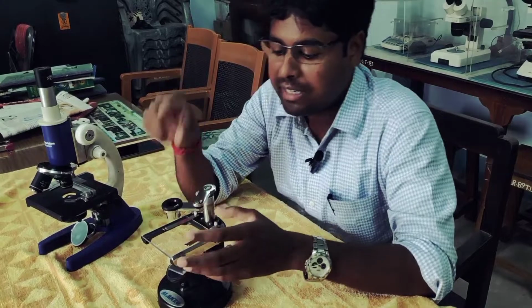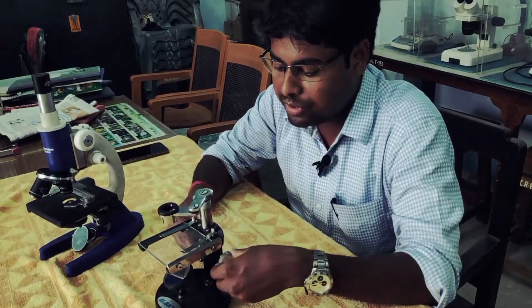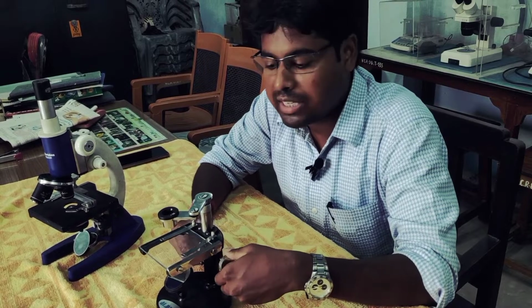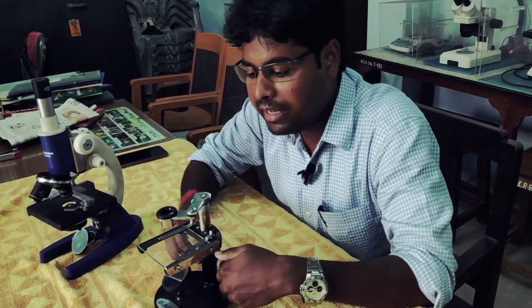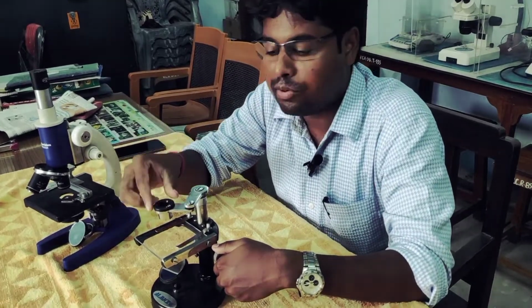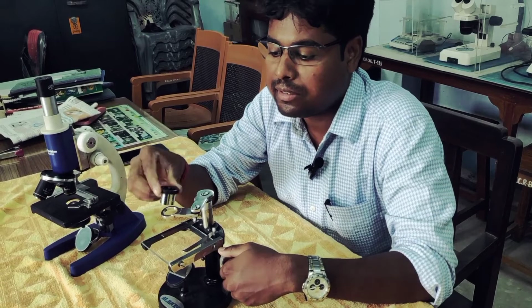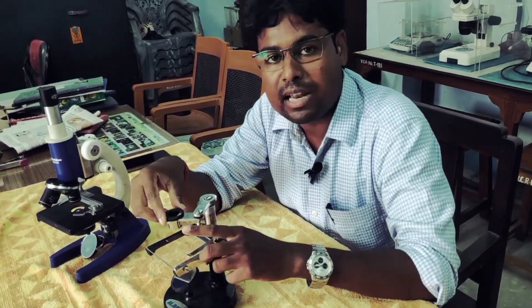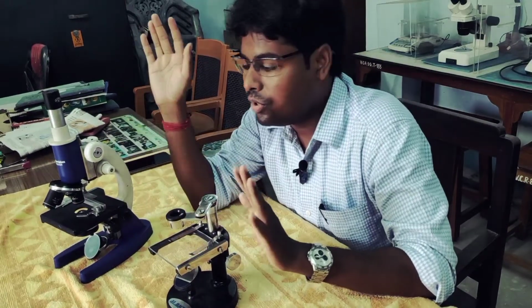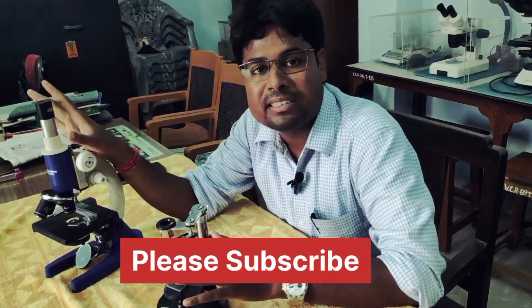You can easily set the slide here, and then use this coarse adjustment screw to move the body of the microscope up and down, and ultimately set the resolution. And this is the eyepiece. Here I use it at 20x, that means 20 times larger than the original size. So that is all about the microscopes and their parts and functions.